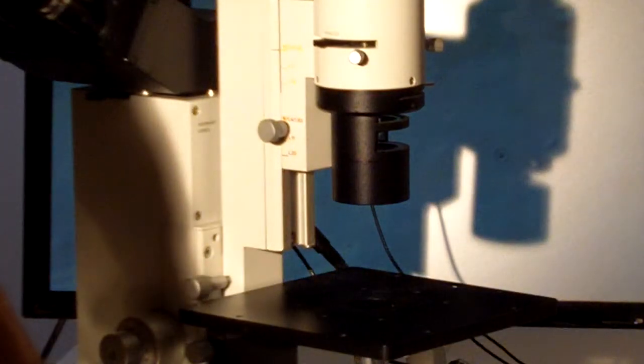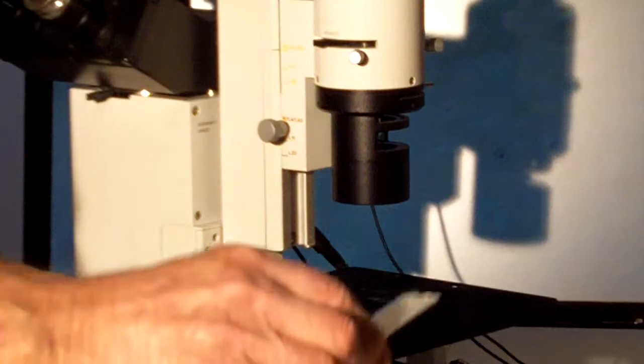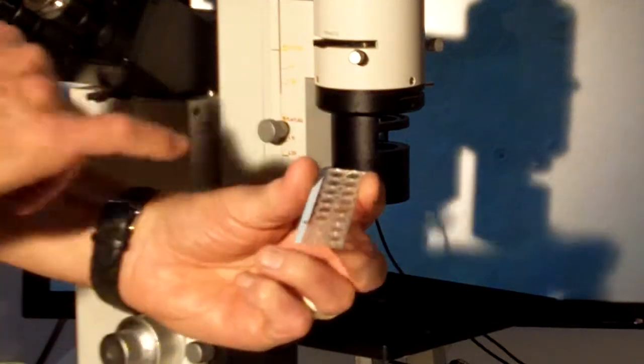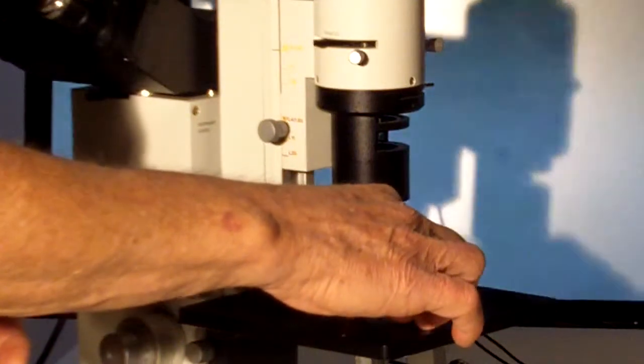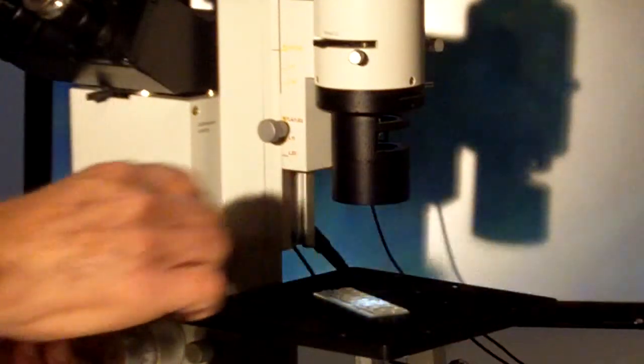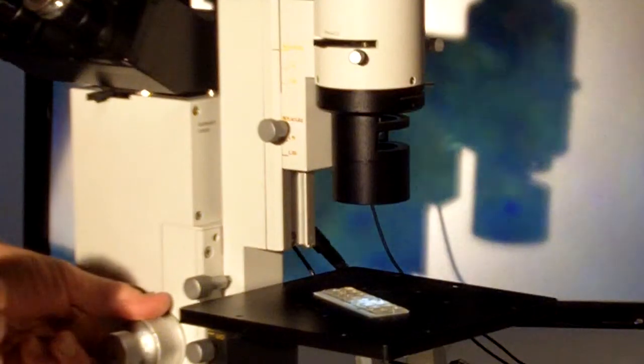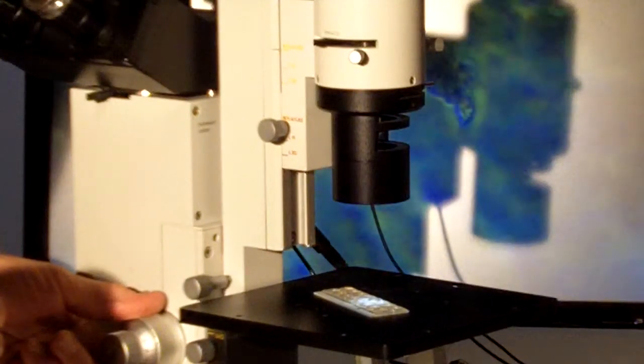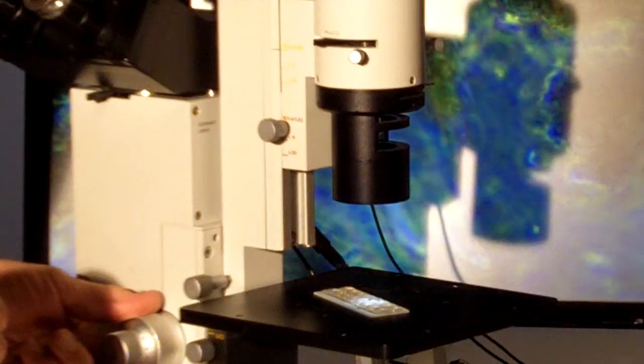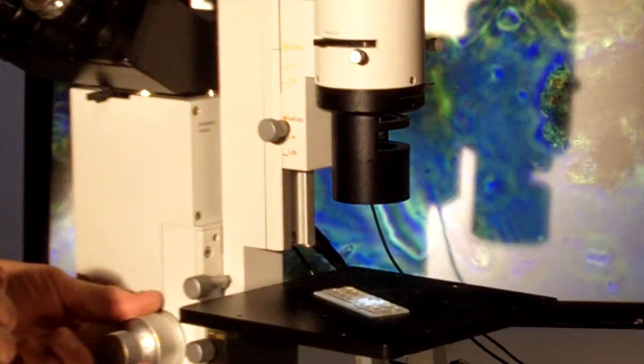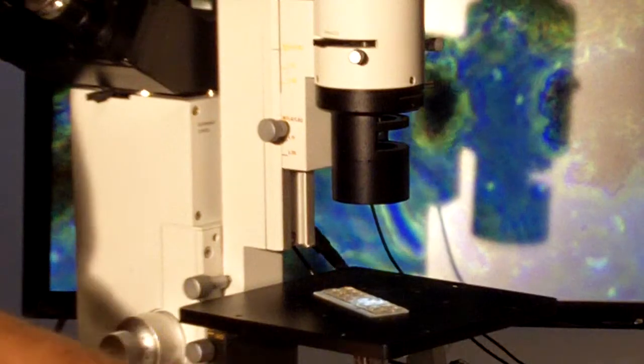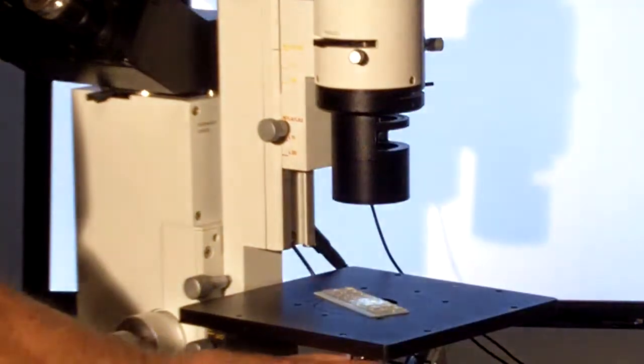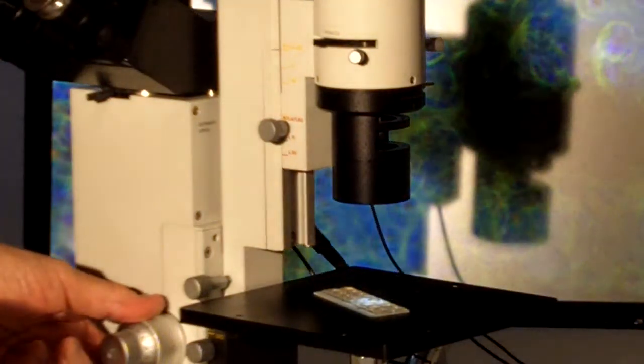They also make three by one micro slides with little individual wells and a flat bottom. Here I've got some of the same pond water sample. In this chamber I'm seeing a lot of little guys swimming by. We can go to lower power, the 20x.